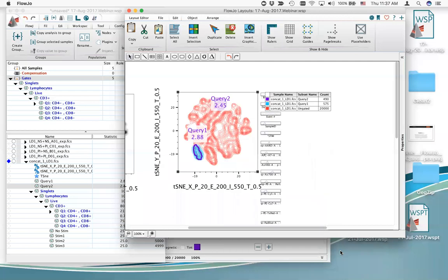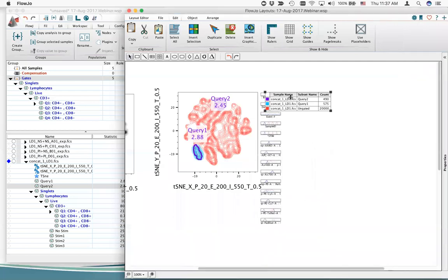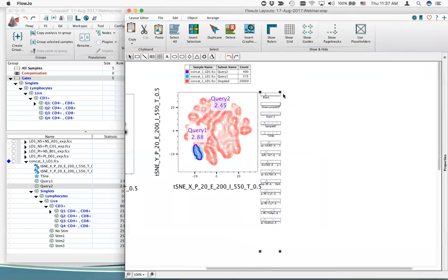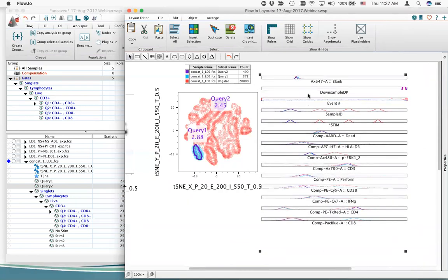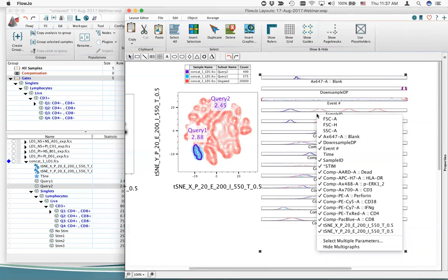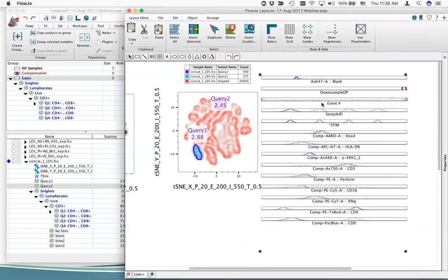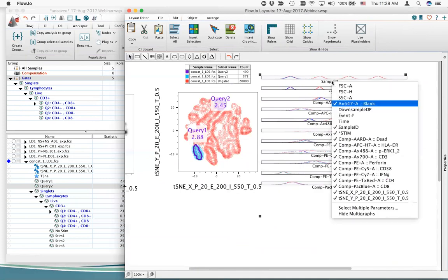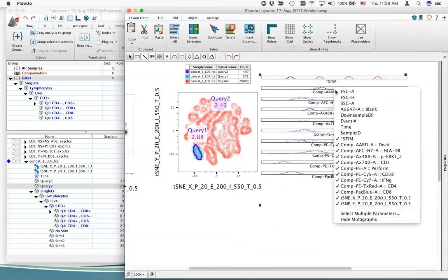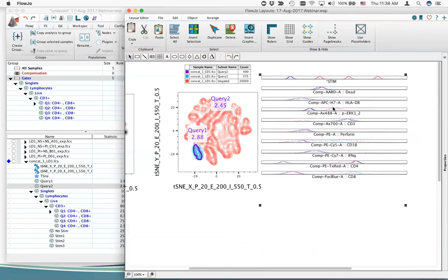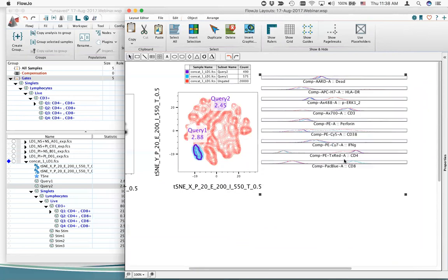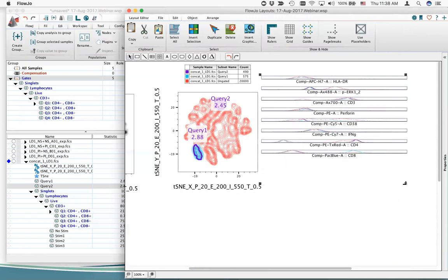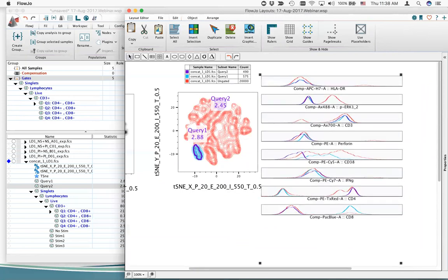Creating histograms shows each parameter. Red represents all events, and the gated query-1 and query-2 are blue and purple respectively. Making it bigger and removing blank parameters leaves all the relevant phenotypic parameters visible.